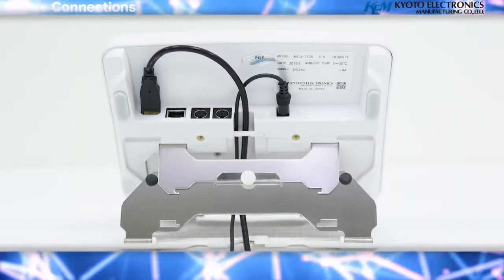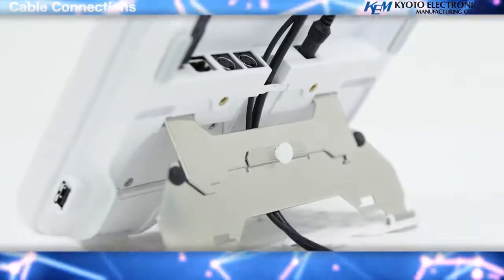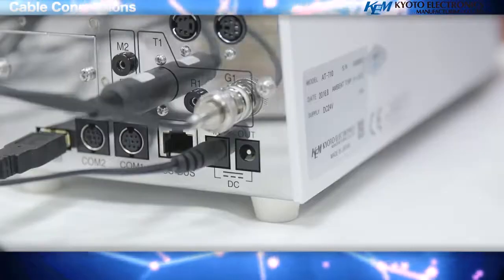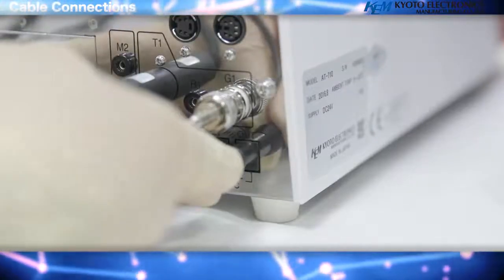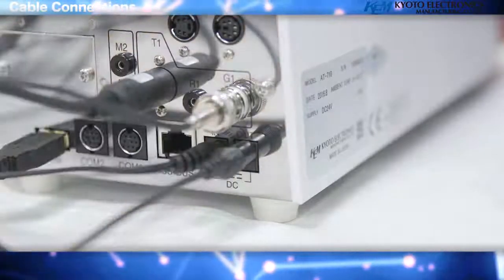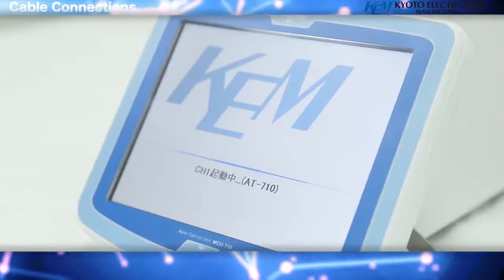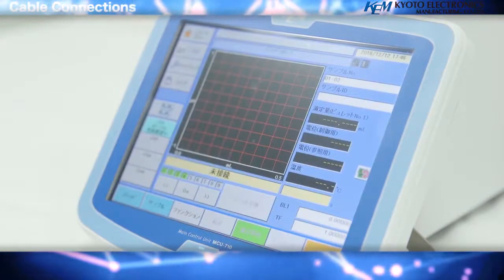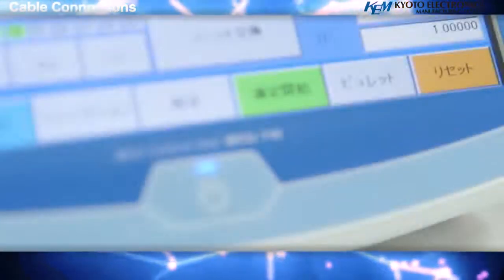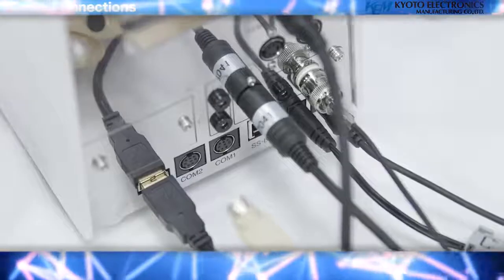The USB connector is used for storing measurement results. Connect the USB memory stick to record and save the method. You can also connect a USB printer, a keyboard for inputting characters, a barcode reader for setting method, and a foot switch that can start measurements without the need to touch the device. By connecting a personal computer, it is possible to control the unit and have data communication via the attached PC.